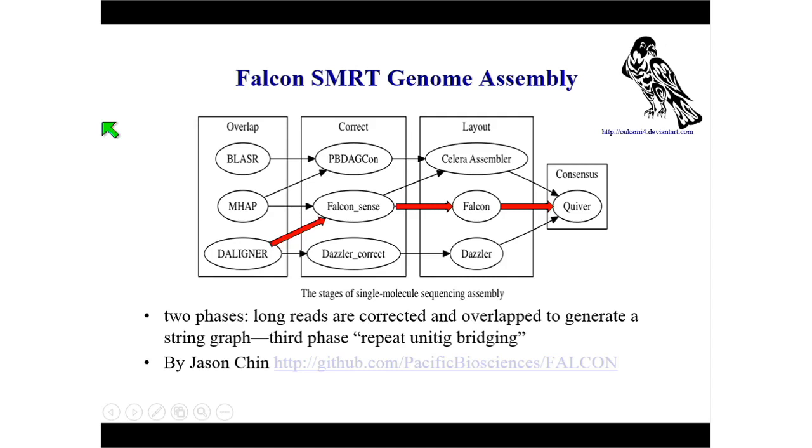For those of you interested, this assembly algorithm is available, and there's obviously data sets that are available now to use it. It is memory intensive, so you need a pretty strong compute farm to get it operating. It took us a month to get this running in our own lab.